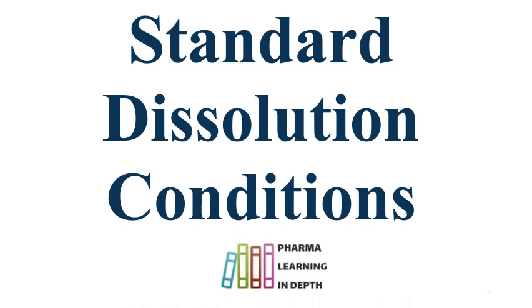So in this video we are going to see what the standard dissolution conditions are, when these conditions are applicable, why these conditions are applicable for IR formulations containing highly soluble drug substances, and what to do if we are not meeting or not matching the standard dissolution conditions.